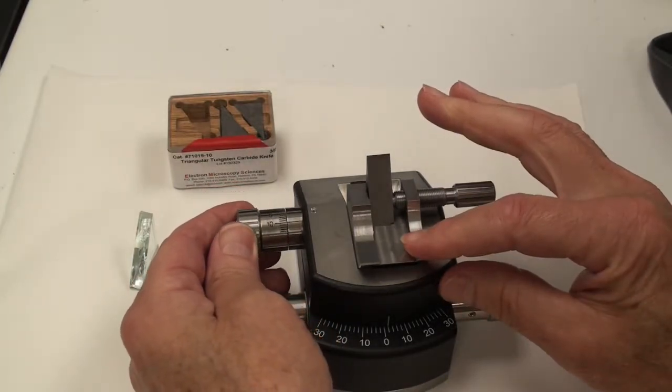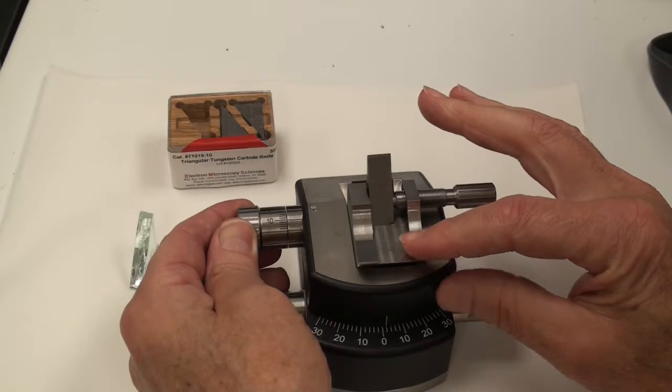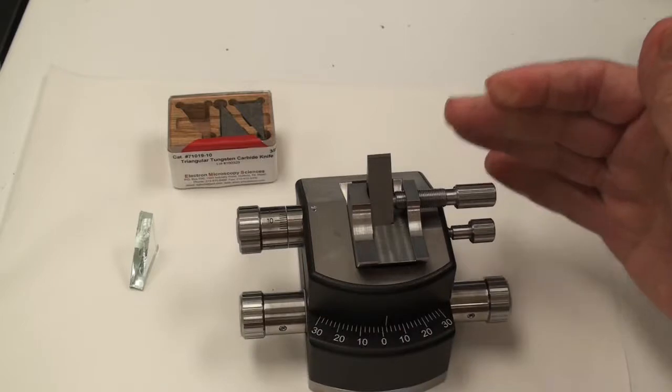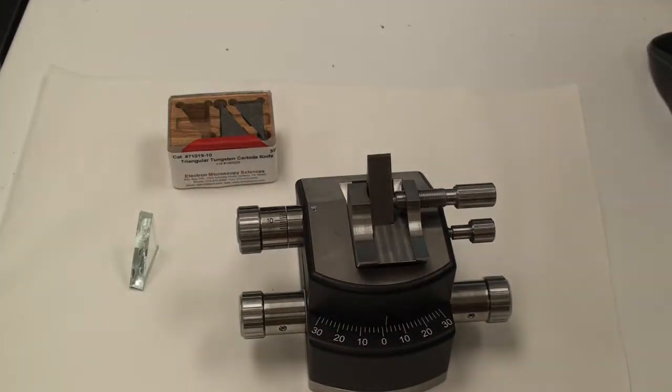Just remember to reset your clearance angle back when you put in a diamond knife for thin sectioning or a glass knife. So now that's ready, let's take a look at facing it off.